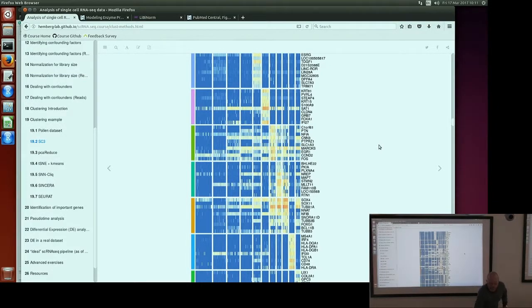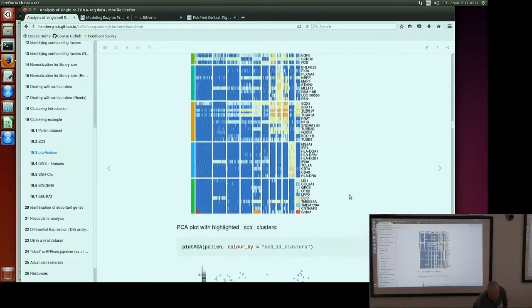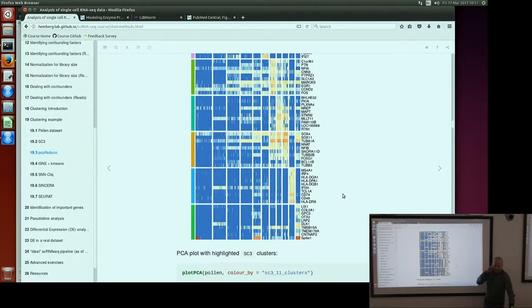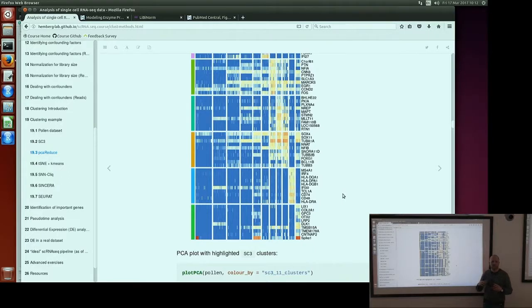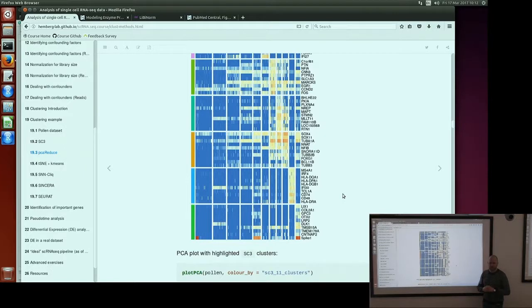There is also a cell outlier tab. Cell outliers are defined as cells which are quite far away from the center of mass of the cluster they belong to. The cell was assigned to one of the clusters, the algorithm finds the center of gravity of the cluster, and if the cell is far away from the center, it's reported as an outlier. You have an outlier score — the higher the score, the stronger the outlier. This information is also saved in your phenodata table in your SCATER object.